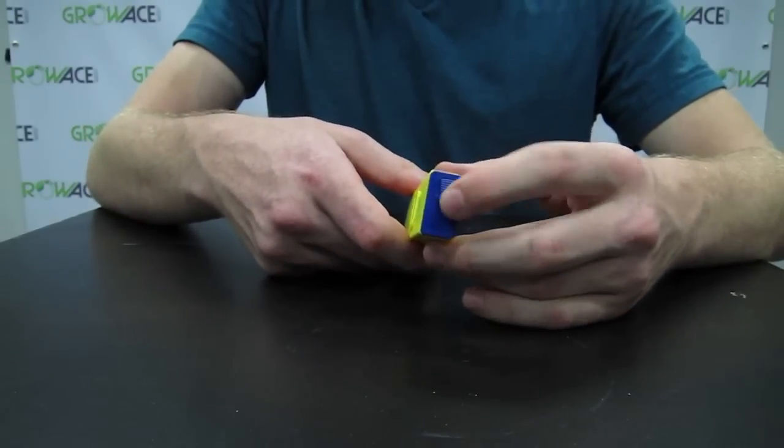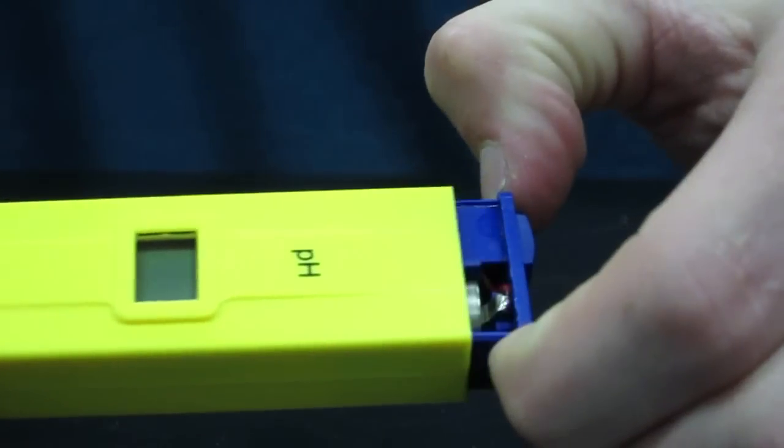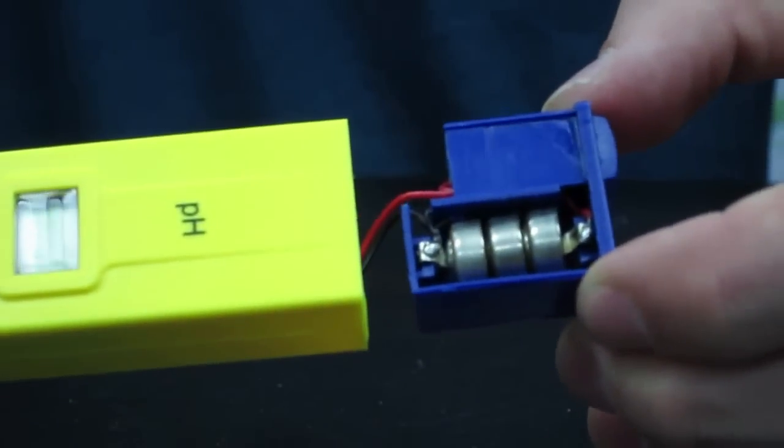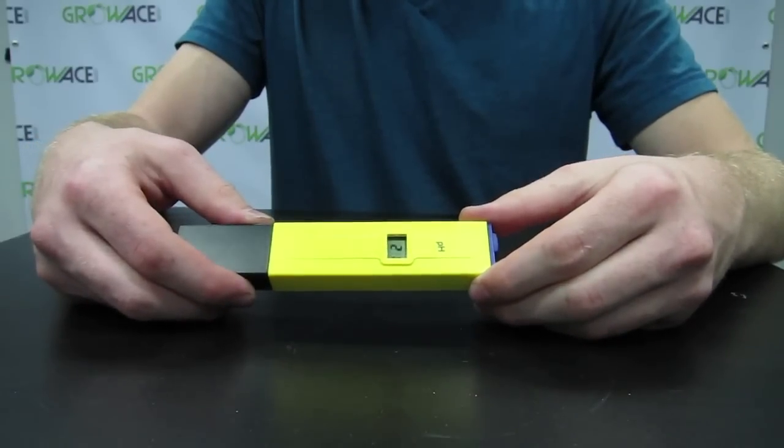A quick anatomy of these pH meters. From the top is your on and off button. You can pop the top off to expose the batteries. These pH meters take three 1.5 volt batteries and that's enough to last you 700 hours of use.